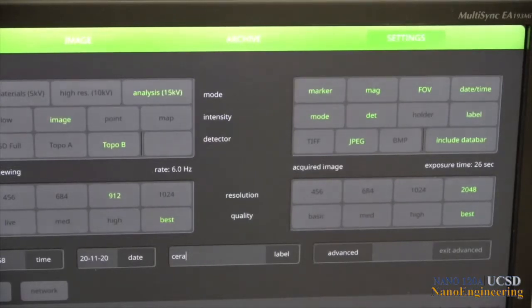To label samples, click on the menu titled label in the middle of the screen. You can then click in the box next to it and type in your label with the computer keyboard or the on-screen keyboard that appears.